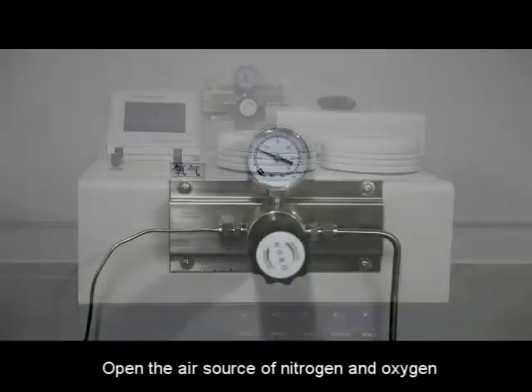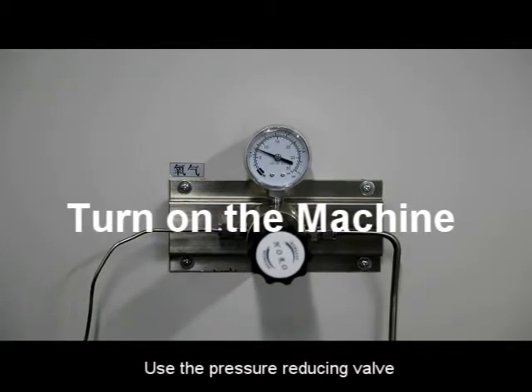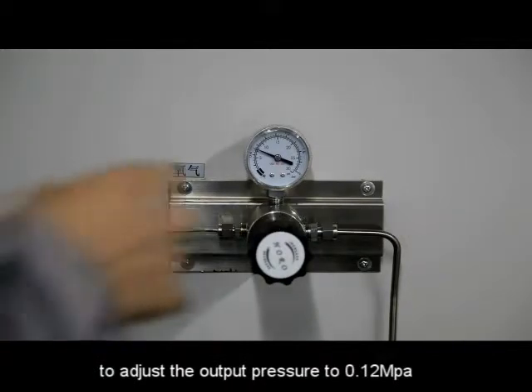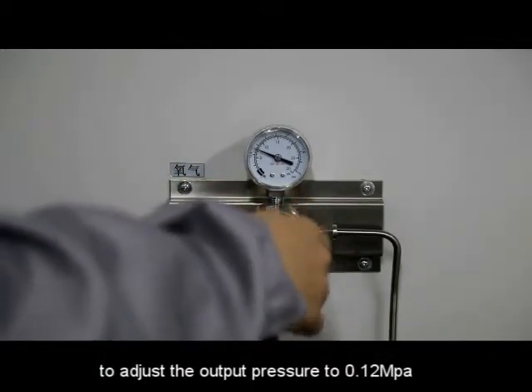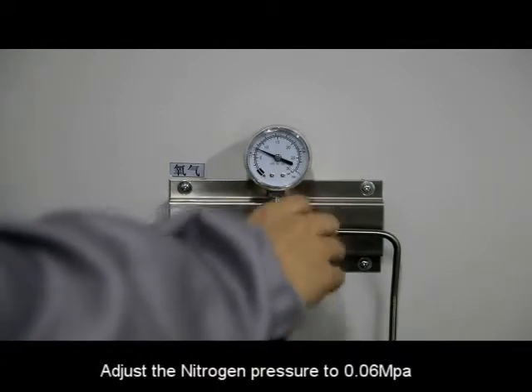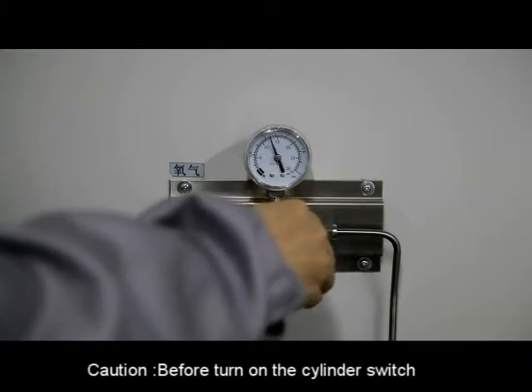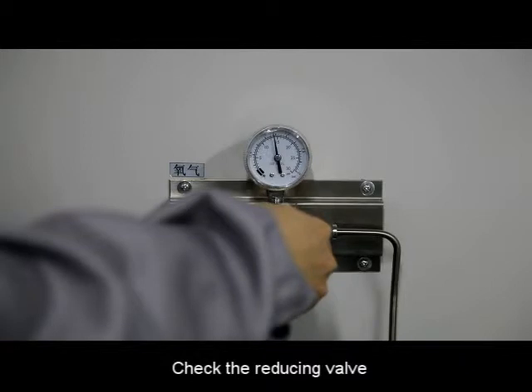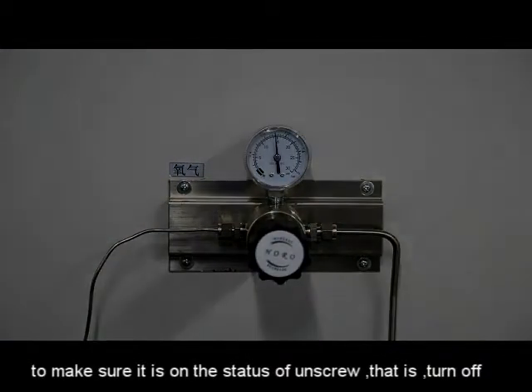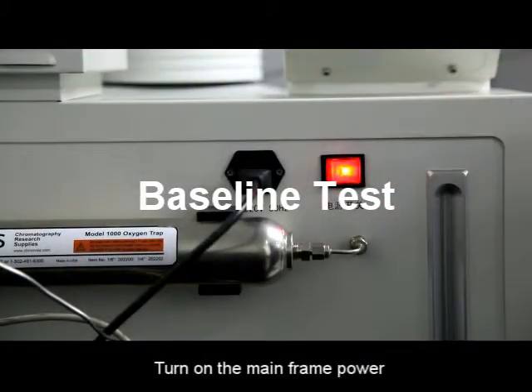Open the air source of nitrogen and oxygen. Use the pressure reducing valve to adjust the output pressure to 0.10 MPa. Adjust the nitrogen pressure to 0.06 MPa. Caution: before turning on the cylinder switch, check the reducing valve to make sure it is in the unscrewed — that is, closed — status. Then turn on the main power.